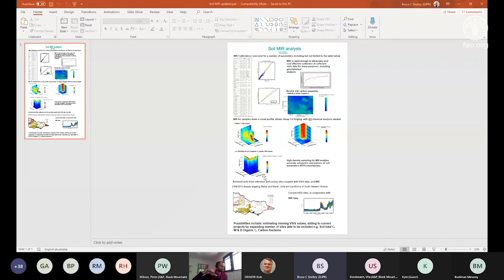The Spectrum 1 actually covers a fair bit of the top part of the NIR range, and there's actually information there that adds to the reliability of predictions. When you get to the handheld, this is not on a ground sample like we use for the laboratory. This is actually on a PED, but it just shows you slightly shorter scanning time. It gets fairly noisy, and you've got a lot less spectral information. You're missing all of these tones here. So for some parameters, it's really significant. For others, it's not that significant.